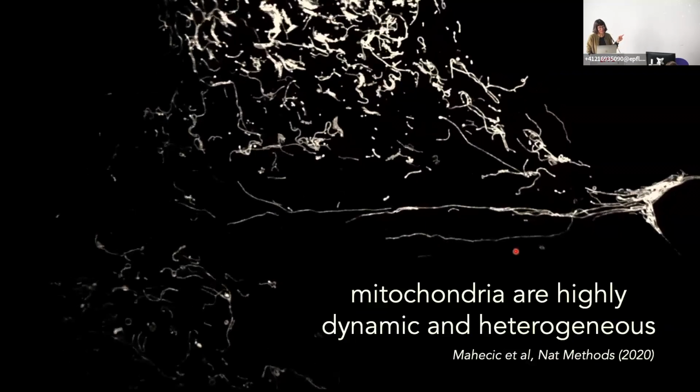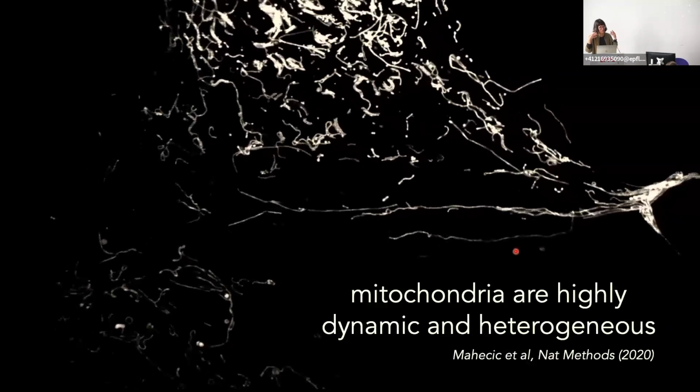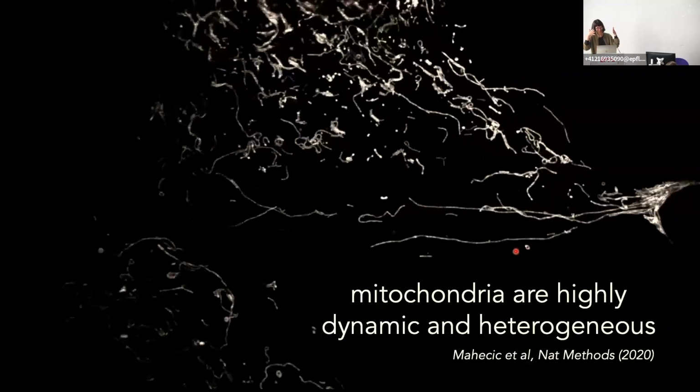It is really not simple. There are people in my lab who have over the years developed their neural networks to be able to detect mitochondrial divisions. And thanks to them, we have built up large enough data sets to train actual artificial neural networks to detect mitochondrial divisions. But this is a really challenging problem, as you could imagine.